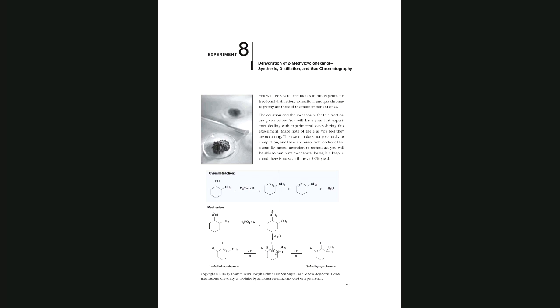I have to place my product in ice to make sure that I get the vapor definitely change to the liquid. Yes, ice that. And bring it up.